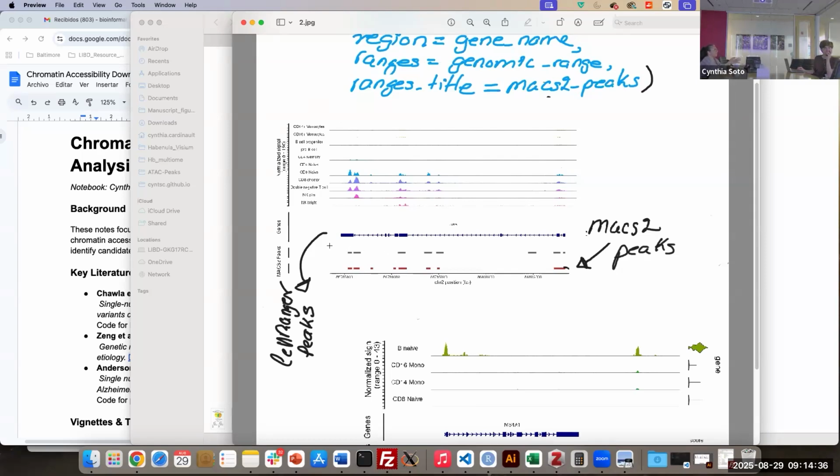In an exploratory analysis, you can first take a look at the peaks detected automatically by the CellRanger-ARC pipeline, but you can also make your own peak set, taking into account different confounders, so you can have a different kind of peak visualization, and you can validate whether the peaks you are looking at in the tracks are the real ones or they have variability for some reason.